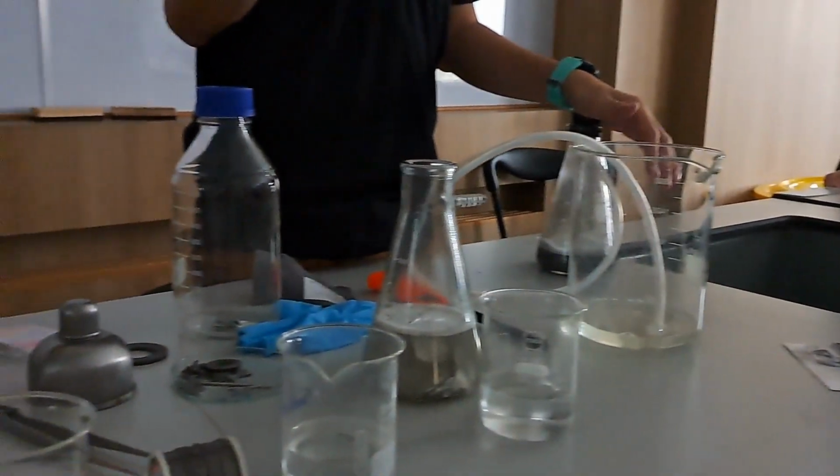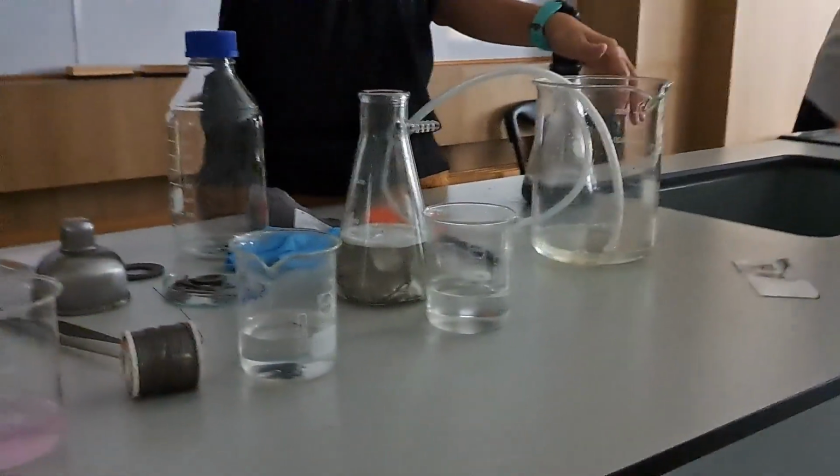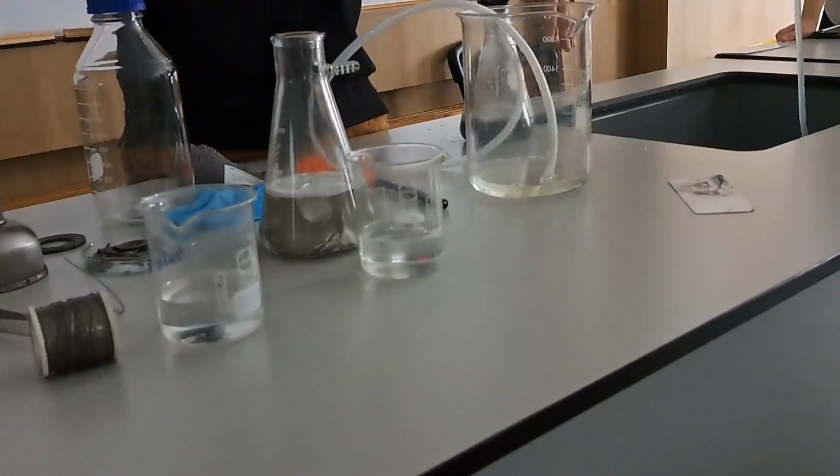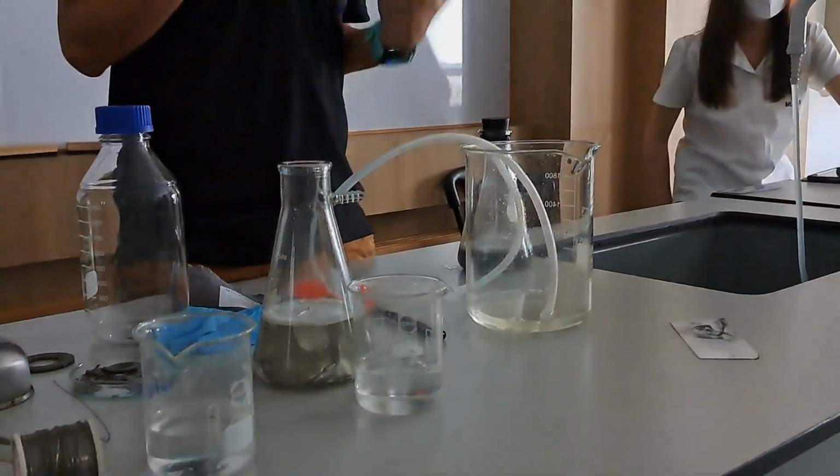Okay, so back to our oxygen test. In the test tube, we put fire in it. Is it flammable? No, because oxygen doesn't burn itself. It's assisting in the burn, so it makes the fire go bigger.